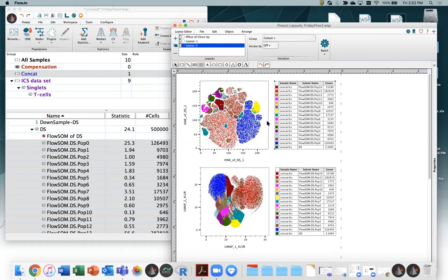Okay, so again, t-SNE, if we're just evaluating the dimensionality reduction tools, tends to push things apart a little farther and spread them out and make it a little nicer to look at. UMAP is telling you how different these things are. So it's telling you that this green, purple, light purpley pink, these are all really, really similar, whereas they're a little bit more spread out here in the t-SNE outcome of this. And these are all just our FlowSOM populations.